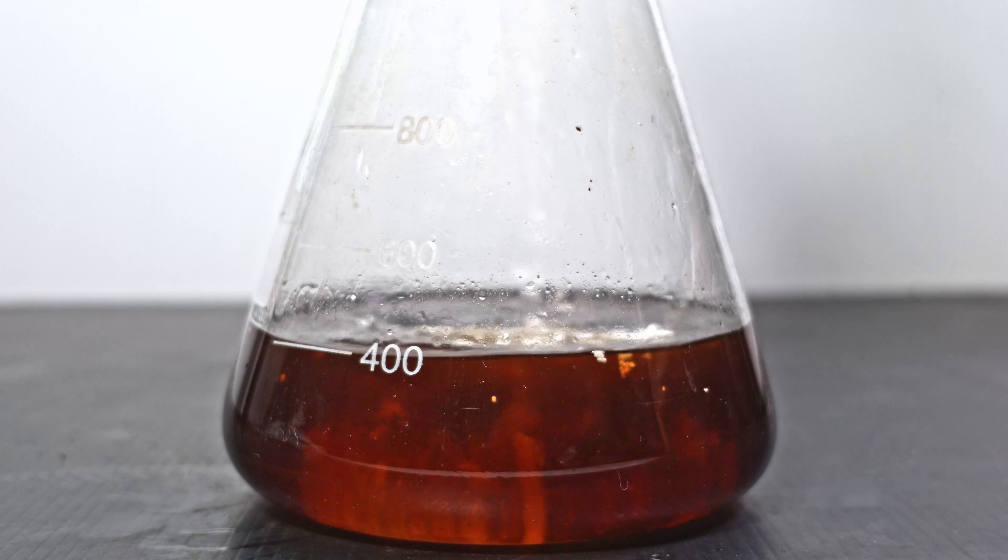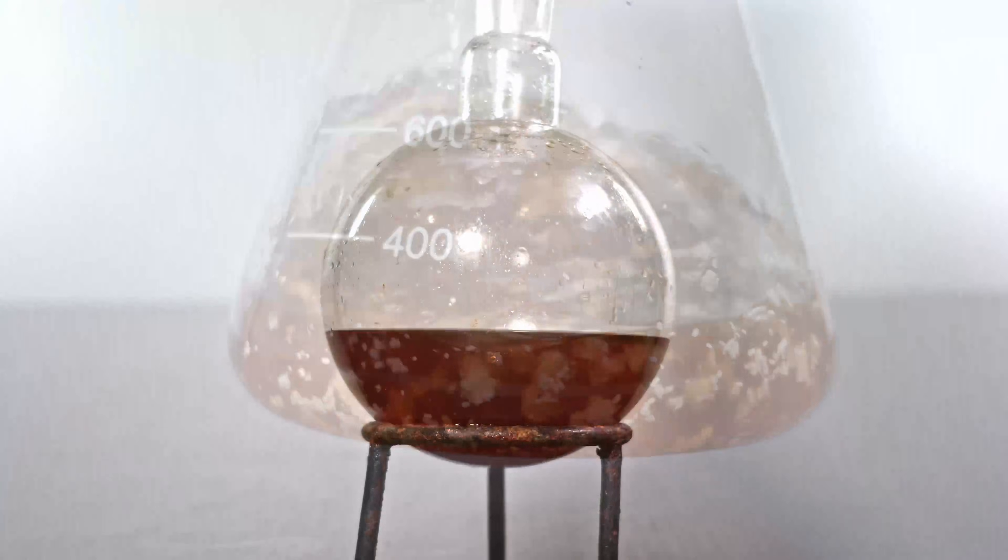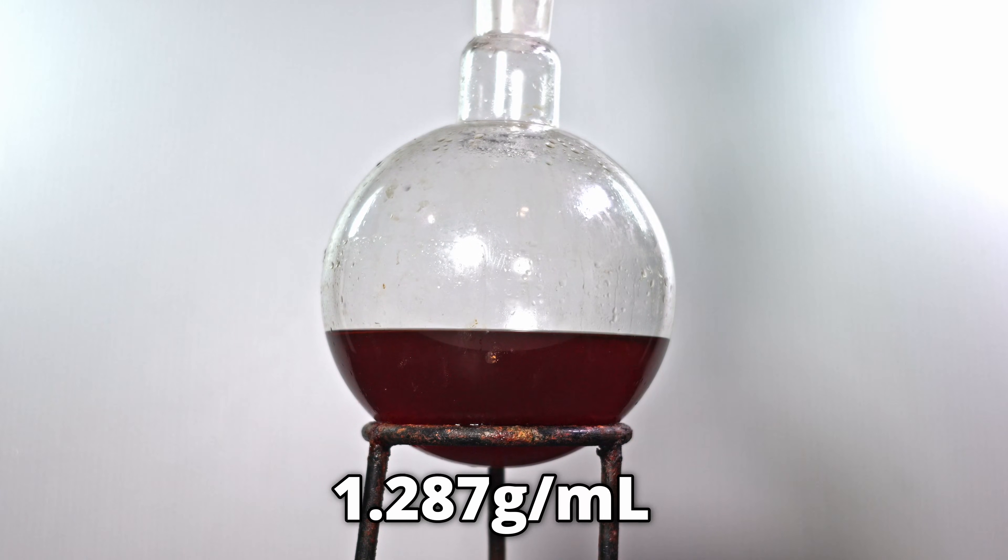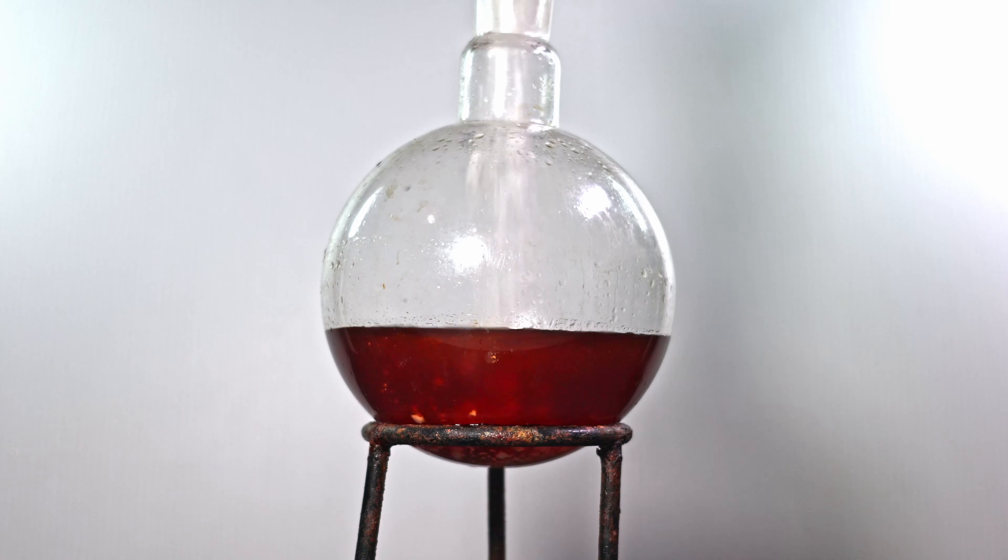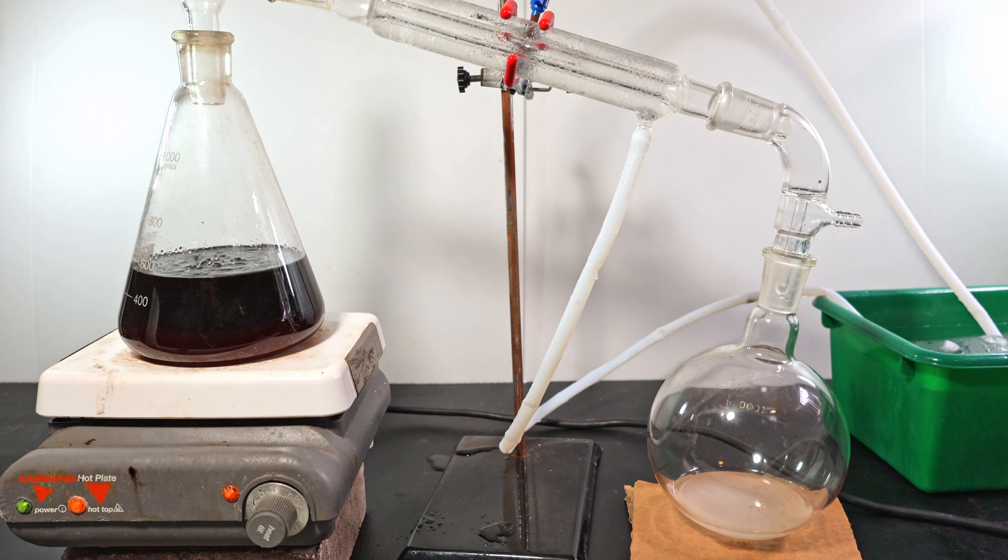I add some magnesium sulfate and stir vigorously to combat this. The lighter crude is 1.287, which is surprisingly close to the heavier crude. I also add in some magnesium sulfate to sop up some of the water.